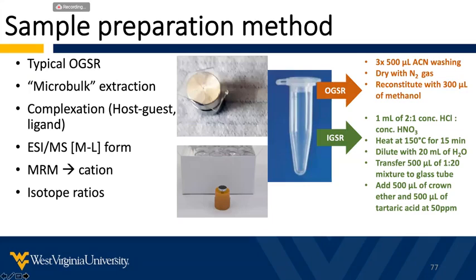So this slide shows you the materials that we use. We have tested both the TESA tag that is in the top image over there and the SEM carbon tape adhesive.